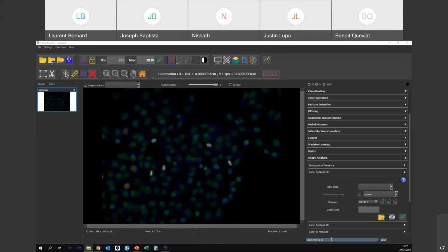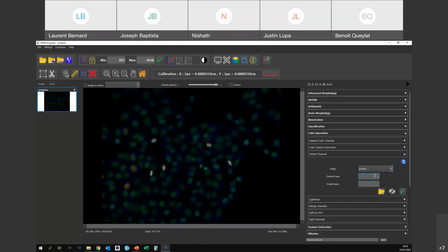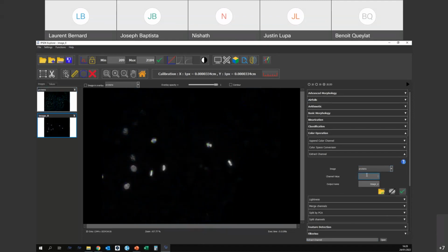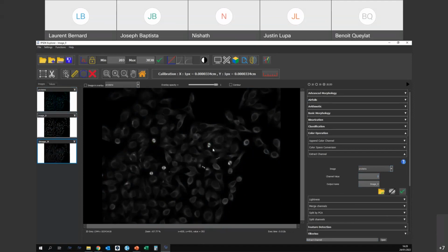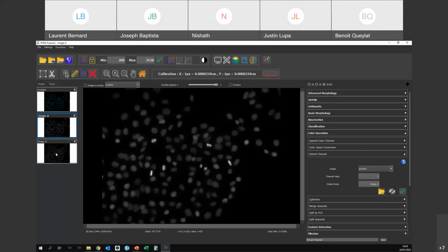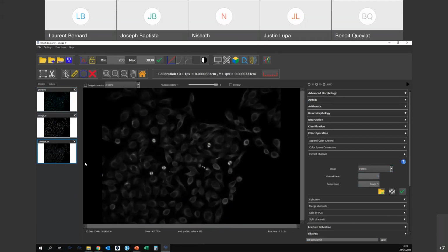So what we can do now is extract some channels. That's very new information we can define. With 4 channels, the channels go from 0, 1, 2, and 3. So you can extract channel 0, you can extract channel 1, and so on. Channel 1, channel 2. And you can see like this the different channels, and we could also extract the 2 other ones.